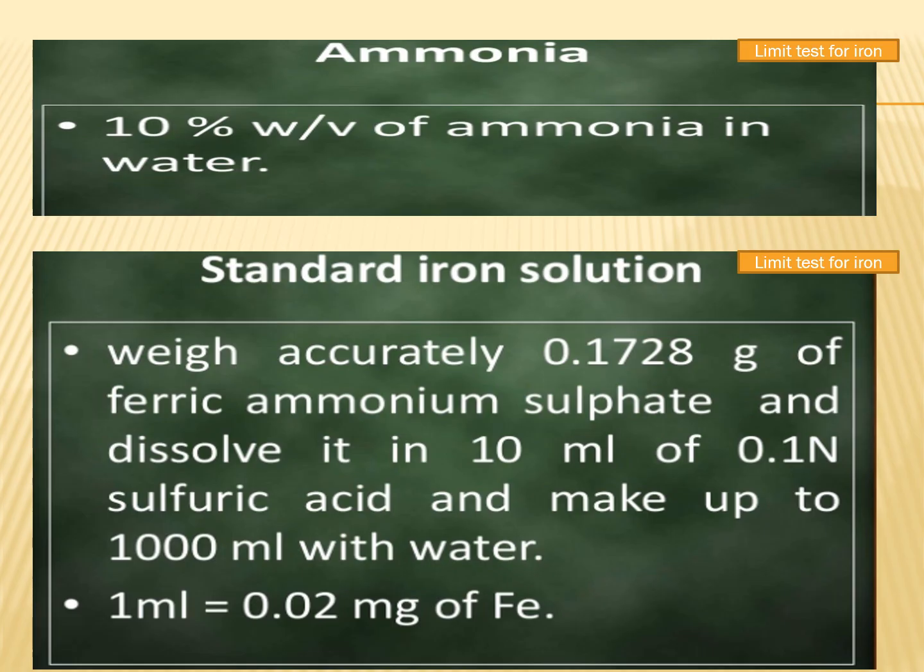That is, 1 ml is equal to 0.02 mg of iron. So we are taking this standard solution in the standard apparatus.